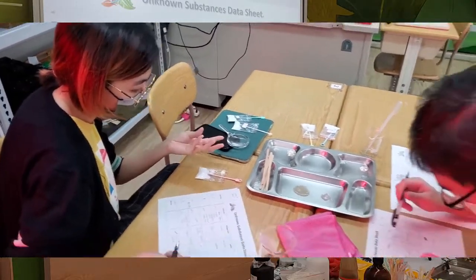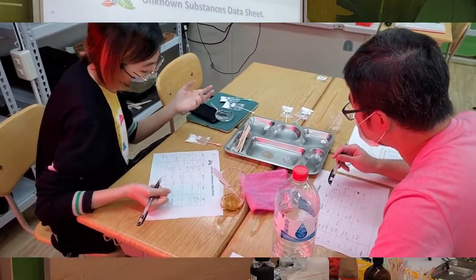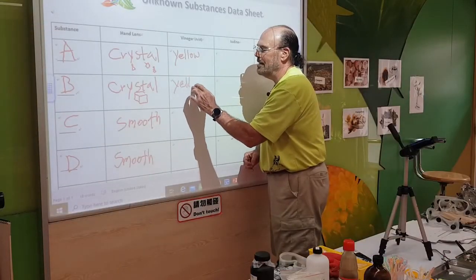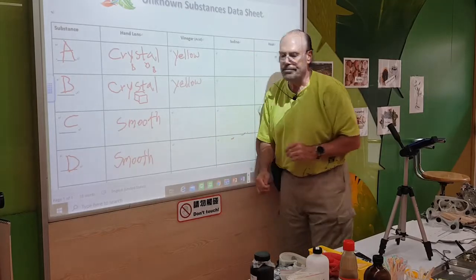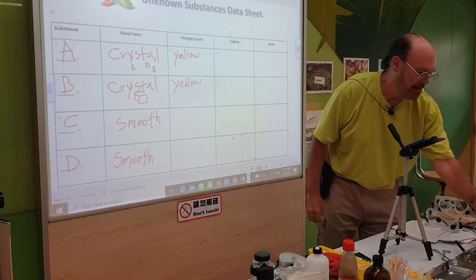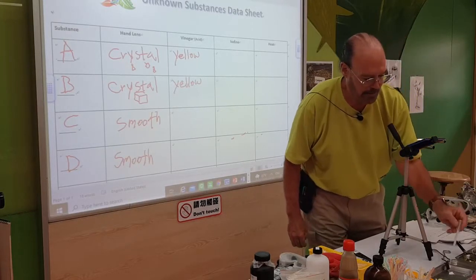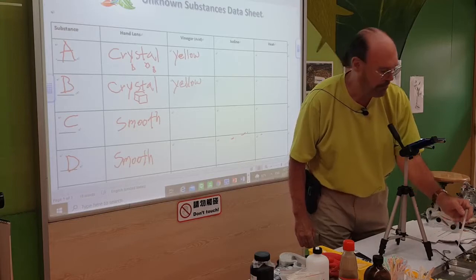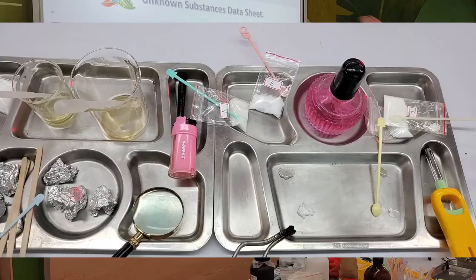It's kind of the same, yeah? So let's write yellow on B. Now let's try C. What happened?